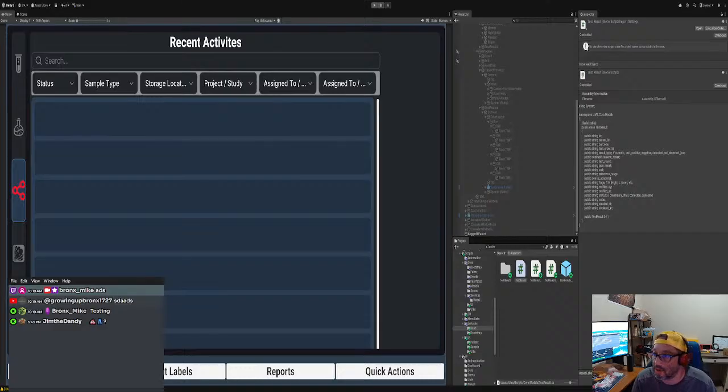All right, so we are going to park this right here to the side, just so we could follow that example that we have. And then test results panel. All right, so I believe I wrote it. Let me find my thing.